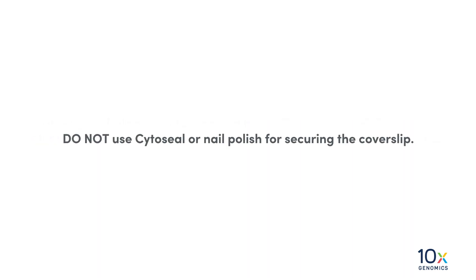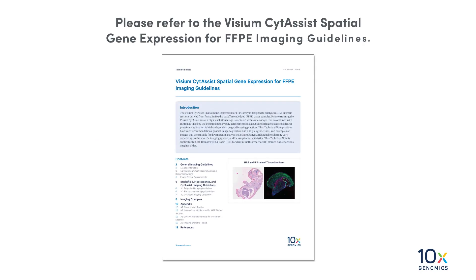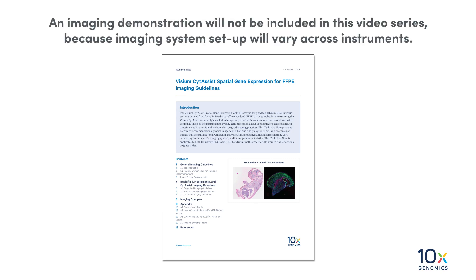Do not use Cytoseal or nail polish for securing the cover slip. Please refer to the Visium CytAssist Spatial Gene Expression for FFPE Imaging Guidelines. An imaging demonstration will not be included in this video series because imaging system setup will vary across instruments.